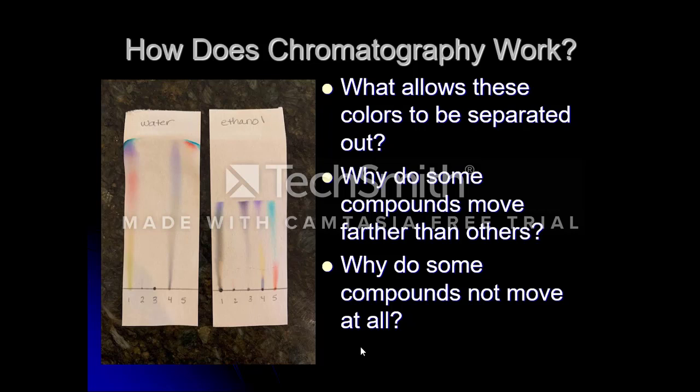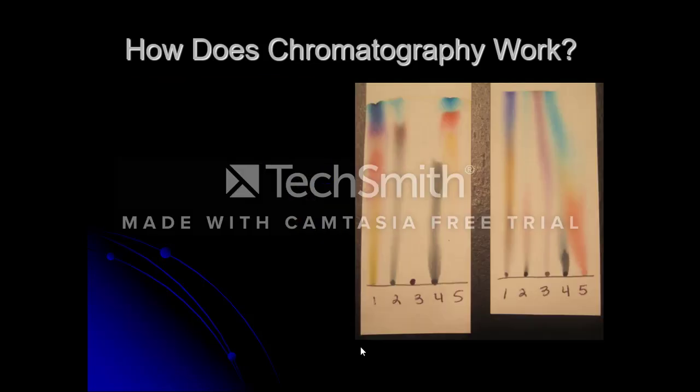So Sharpies have intermolecular forces that don't make them attracted to water. Now you can see that number 3, the Sharpie, moved in ethanol, and that's because it does have forces that are attracted to ethanol. Okay, and we'll talk a little bit more about that.